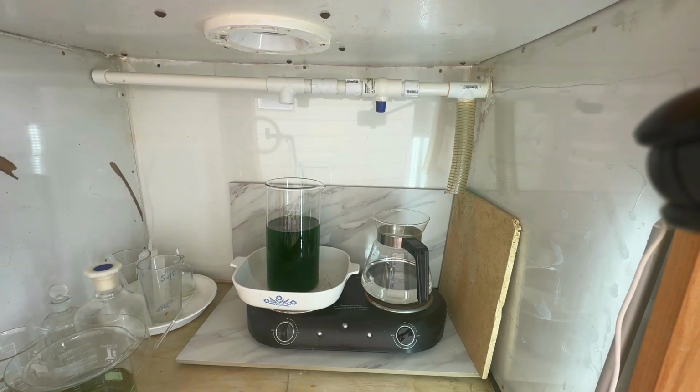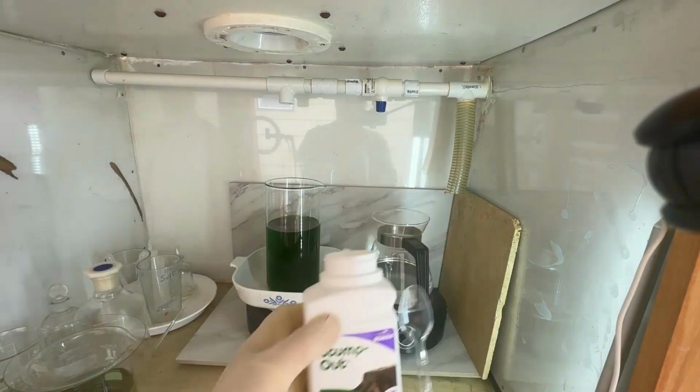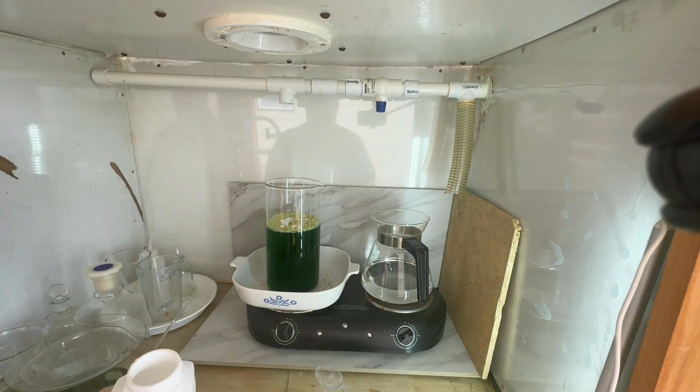All right, for our recovery out of this relatively ugly solution, we're going to go ahead and use our SMB. This is just Stump Out, Lowe's Stump Out, can be bought at Home Depot. So we're going to put a couple of teaspoons in here, let the foam that forms on top settle down a little bit, give it a couple of stirs, and then we'll see where we're at.